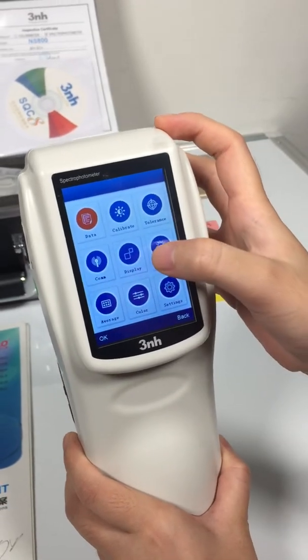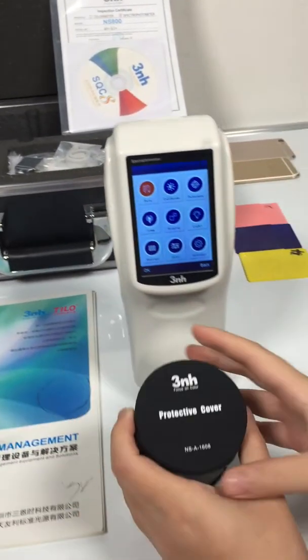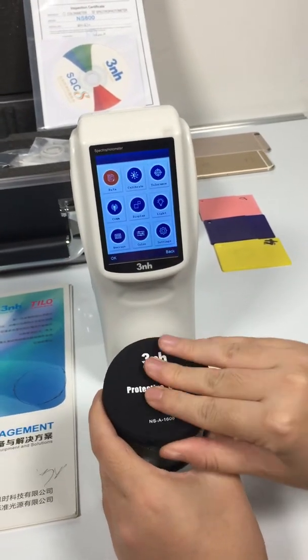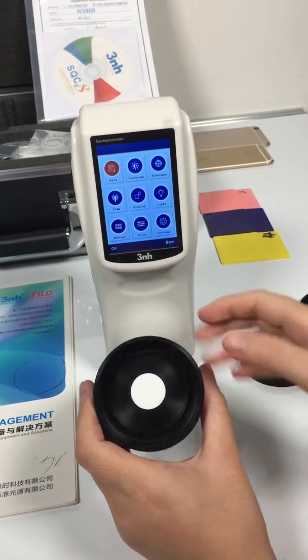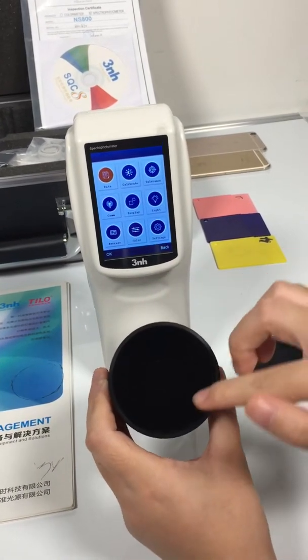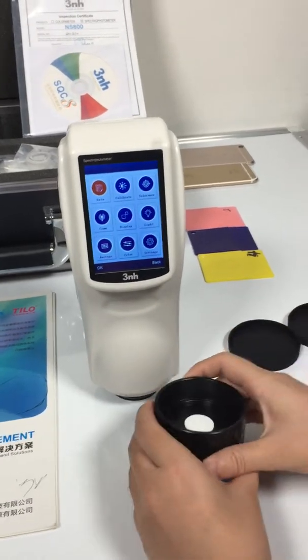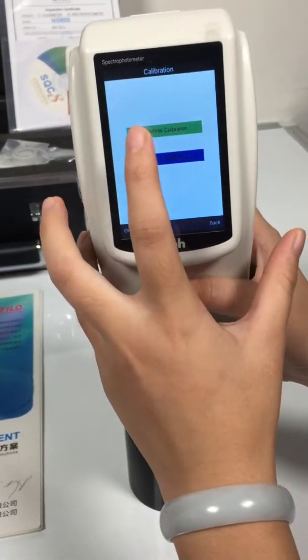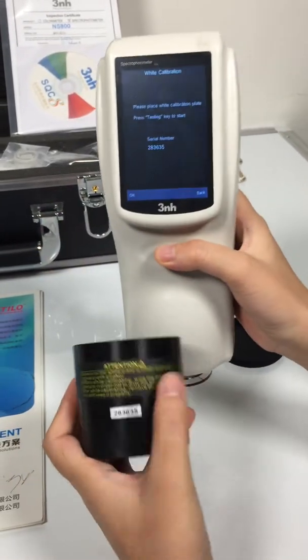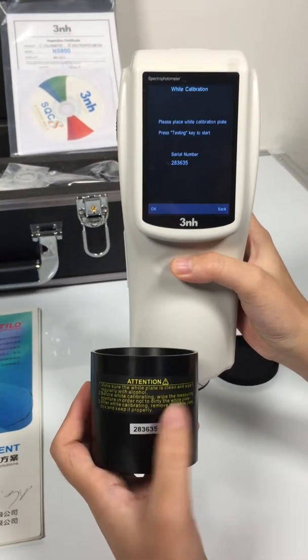We do the calibration first. This is the calibration board. This is the white calibration board and this is the black calibration board. And this is the serial number for the calibration board.